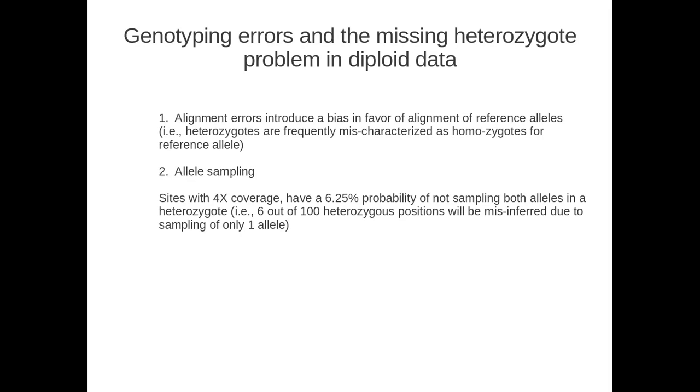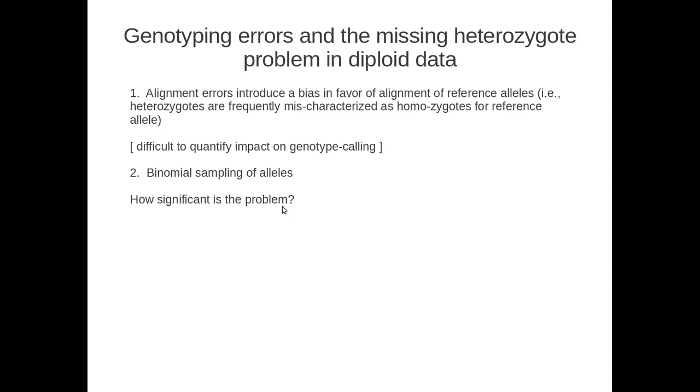So we're concerned about this in some of our data sets. One of the projects I'm working on is on the date palm genome, where we're sequencing 100 different varieties of date palm. This is in collaboration with New York University Abu Dhabi, where I spent some of my time. And we're really concerned about this problem because of how heterozygous date palms are. There are millions of positions in the date palm genome in any one variety that are heterozygous, and the raw number of sites that will be misgenotyped due to this type of problem is significant, particularly in regions that have low coverage.